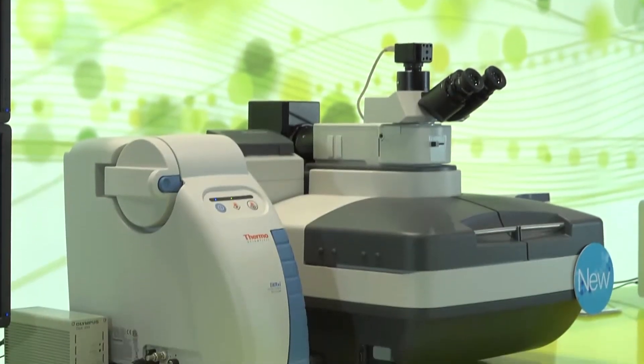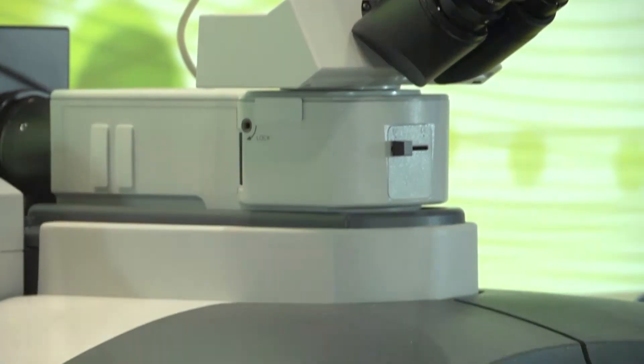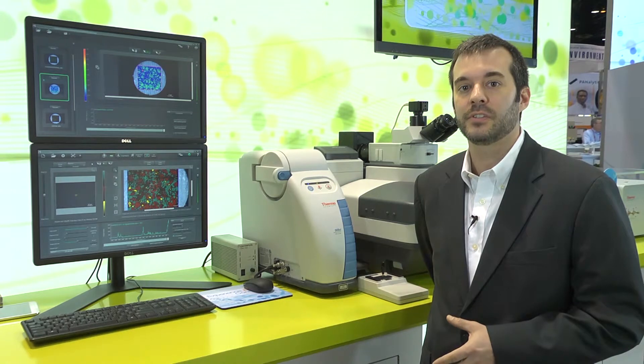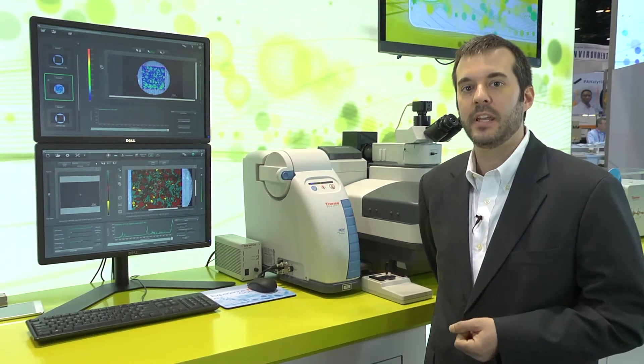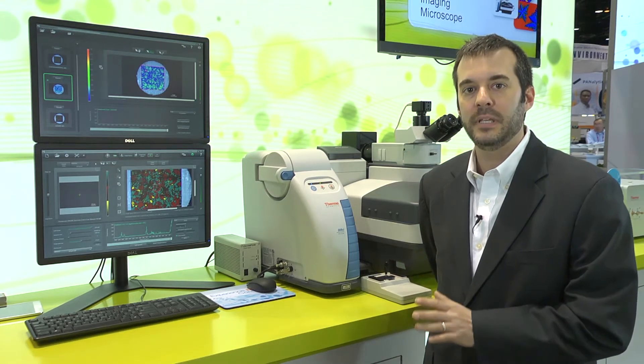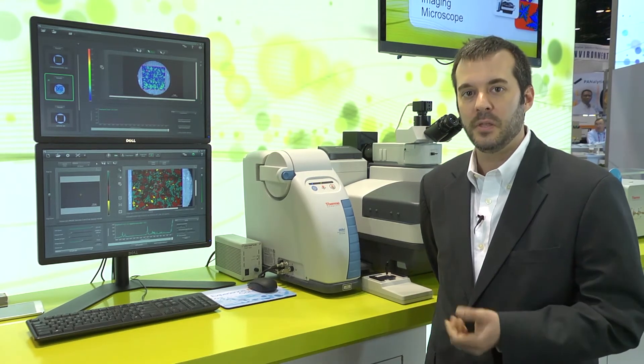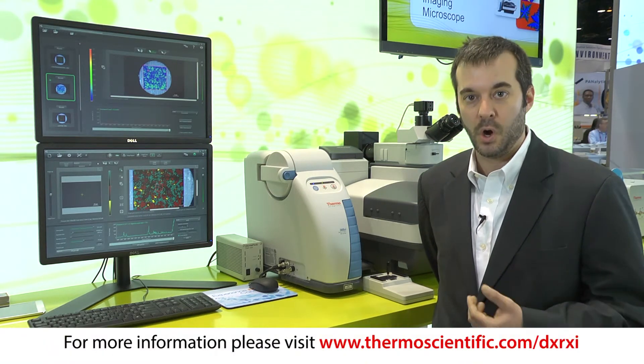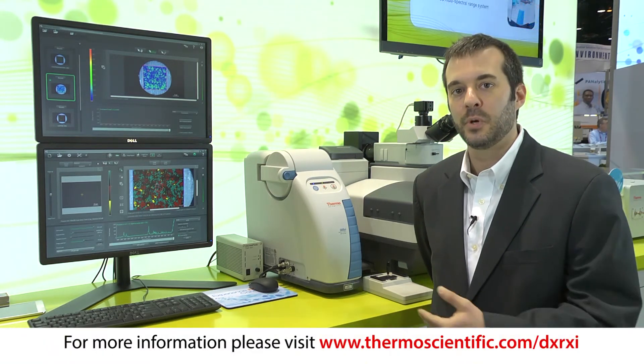Much more than just a faster spectrometer, the DXR-XI is a whole new way of thinking about Raman imaging. We've built expertise into the system to allow users to solve problems much more quickly, using a visual image-centric analysis that really takes high-speed data acquisition to a whole new level, so you get real-time, immediate, instant gratification, and the ability to interpret your results quickly and efficiently. This lets you get on to your next problem and continue pushing your research forward.